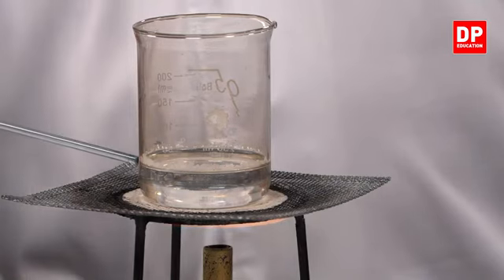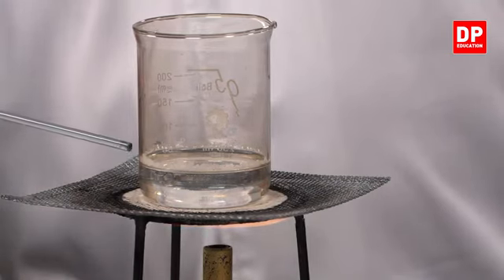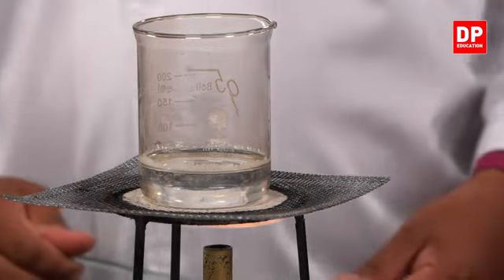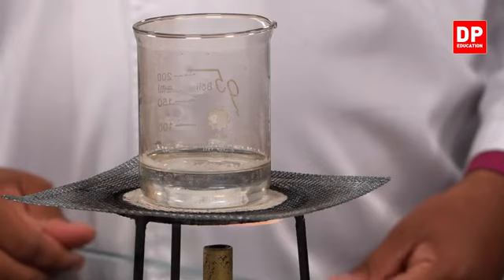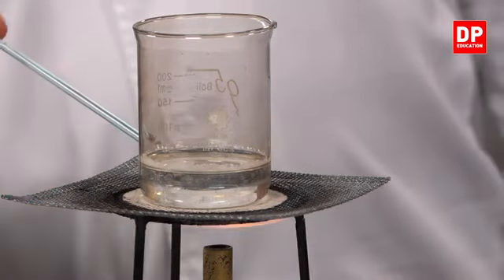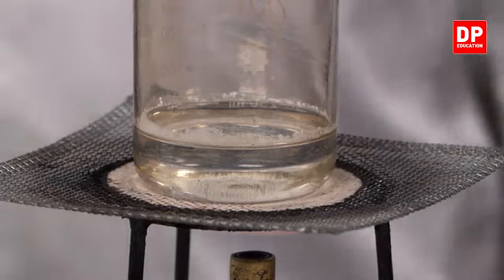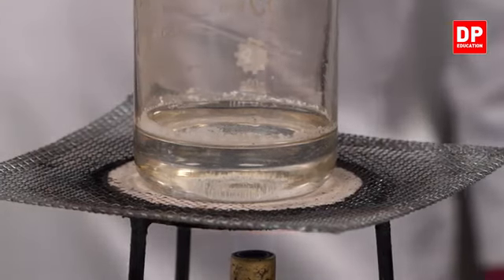Very small drops or very small powder-like things are depositing at the bottom. Observe very clearly. You can even see in this area that white color powder.